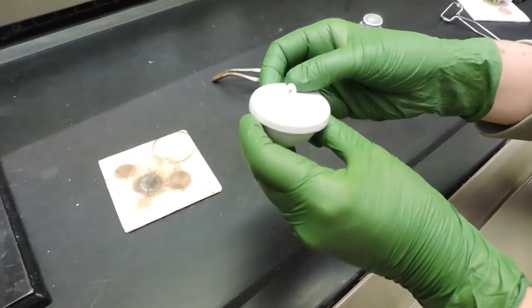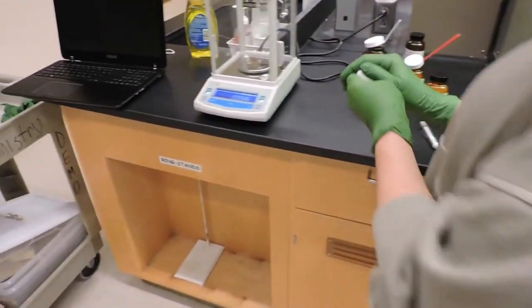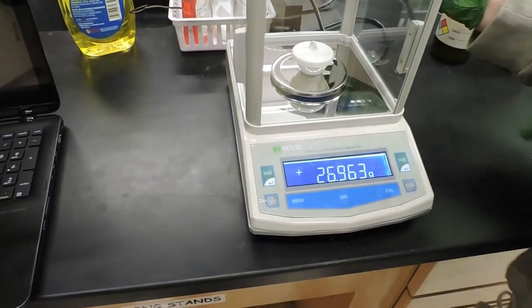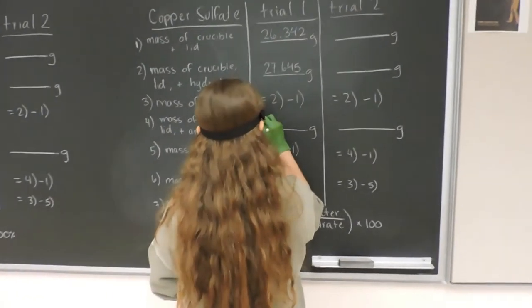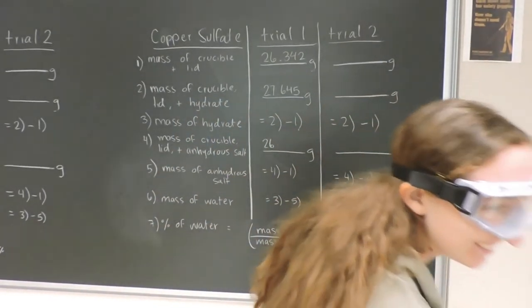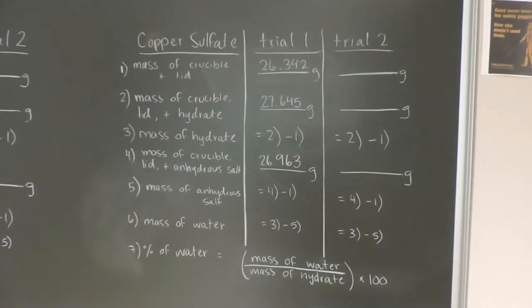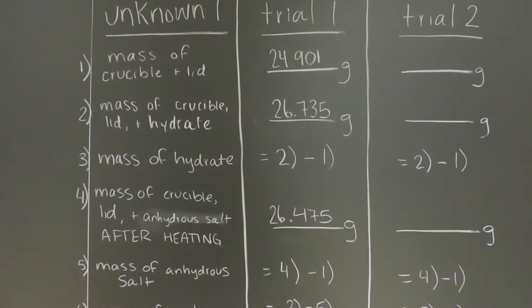The crucible containing the copper sulfate pentahydrate that we evaporated the water out of is now cooled to room temperature and ready to find its mass. After heating, the mass is 26.963 grams. The crucible with the unknown hydrate has cooled to room temperature, and we have also found its mass. 26.475 grams.